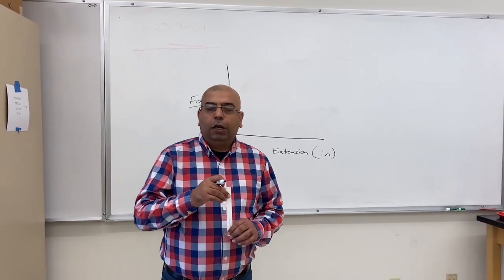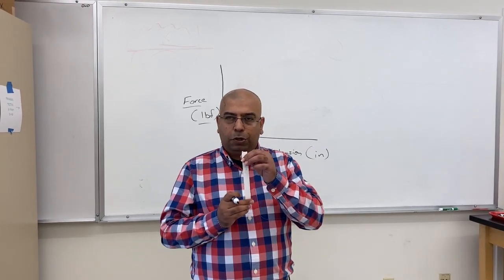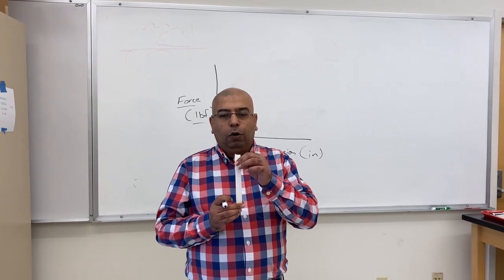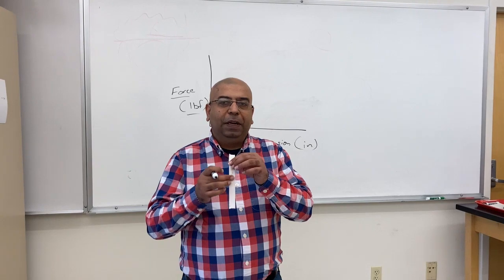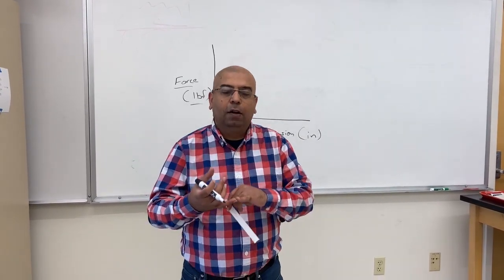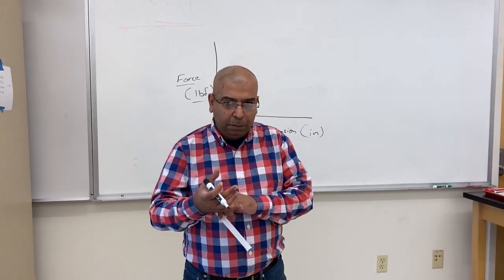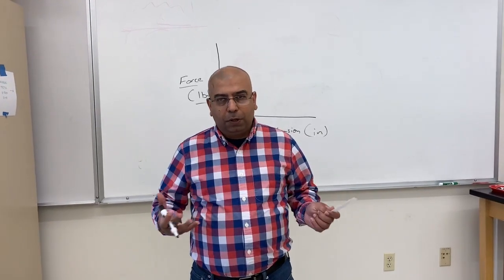Now, as I mentioned a little while ago, when we have force, is that a true measure of the stress in the certain areas of plastic? Maybe it's not. Why? Because a little while ago we talked about, let's say I'm testing 1 mil thick film or 2 mil thick film or 3 mil thick film, and I am measuring the force numbers.